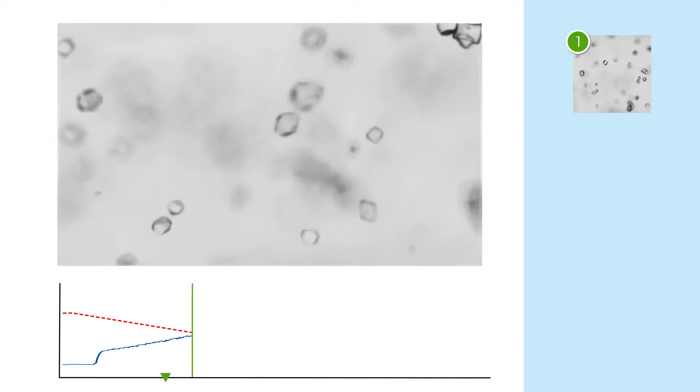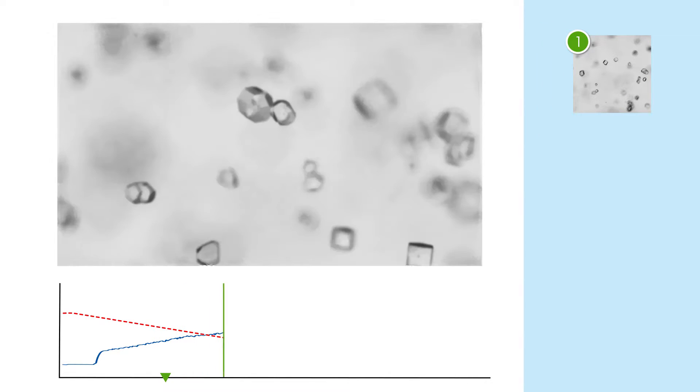Initially, block-like crystals appeared and began to grow, but quickly it becomes clear that agglomeration is going to play a critical role in this process.